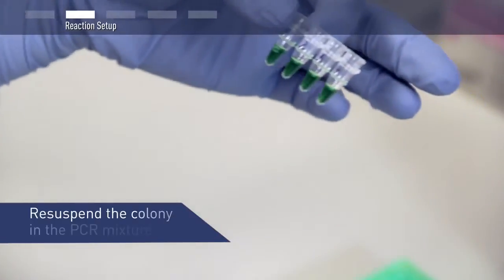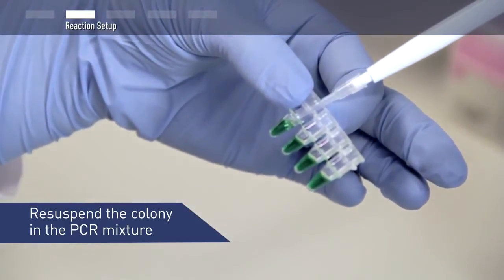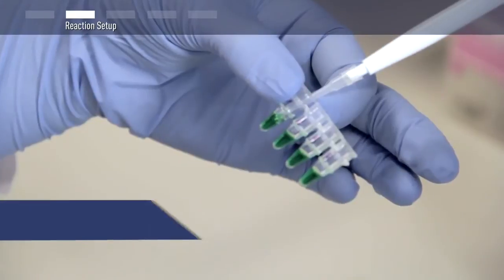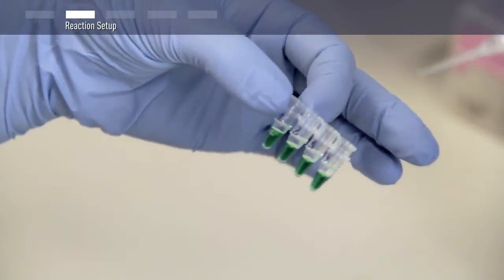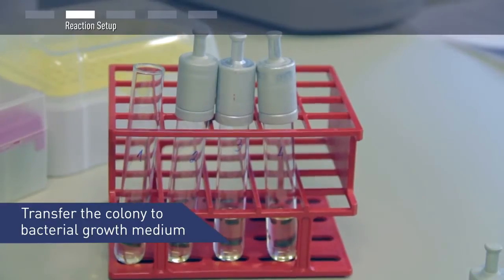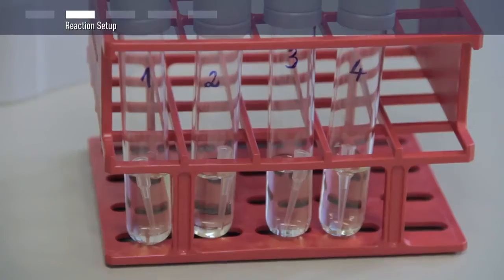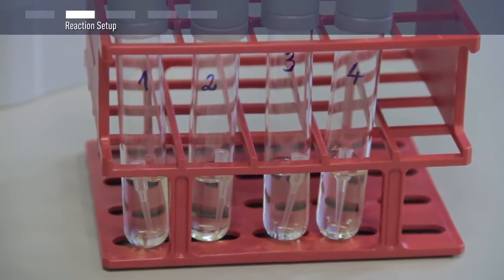Next, with the same tip, resuspend the colony in your one-time PCR Master Mix. In this step, bacterial cells are released into the PCR mixture. Finally, transfer the tip into a labeled culture tube containing bacterial growth medium to grow bacterial cells for DNA purification.